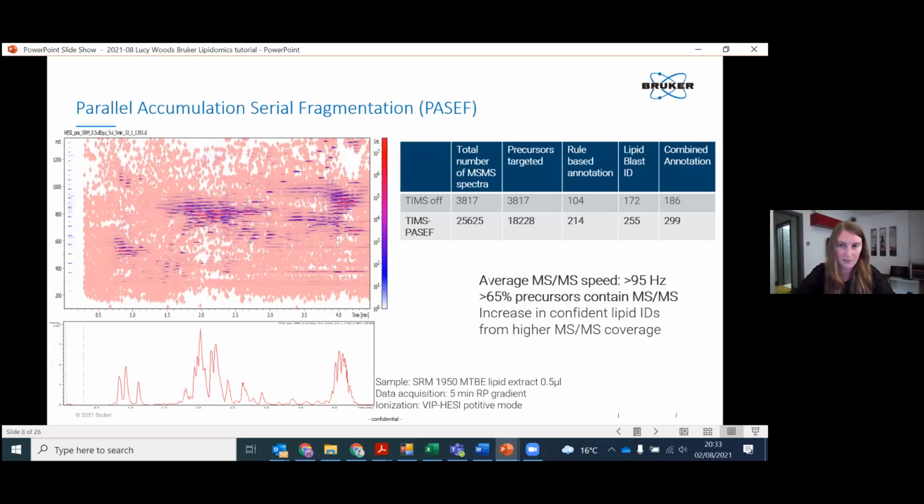So hopefully that explains those numbers in a little bit more detail. And I think the main thing we need to do there is keep increasing these rule-based approaches or library-based approaches, in the case of LipidBlast, so that we can cover more molecular space.